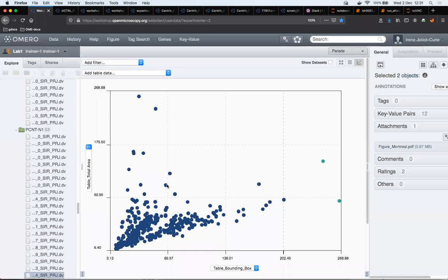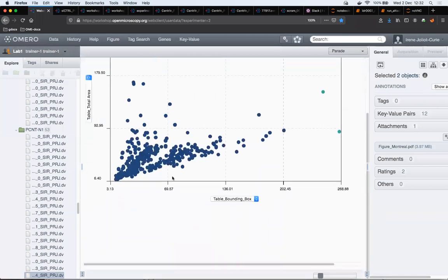It allows you to create publication figures for presenting in a scientific journal, but even more modestly, if you just want to show data quickly to your boss or at a lab meeting, then indeed you can do figure creation in this very quick manner, which we will demonstrate as we go.